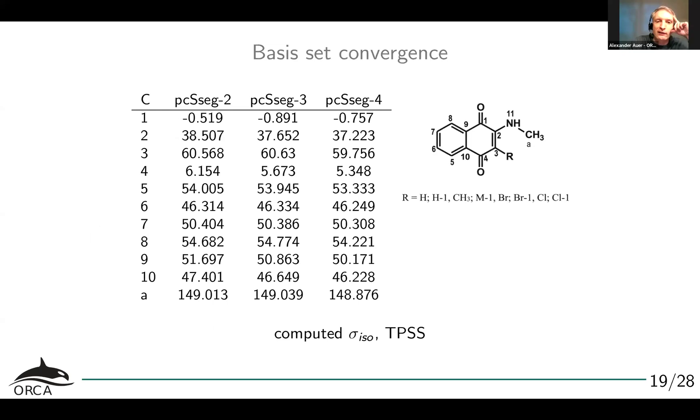What are the results? First of all, let's look at the basis set convergence. This is all with TPSS. If I look at the carbon chemical shifts, what we see is that going from pcSseg-2 to pcSseg-4, the results only change by less than one ppm. This is really nice. It shows us that if we look at the pcSseg-2 basis set, we will likely not be off by more than one ppm. So this gives us a lot of confidence in using pcSseg-2.